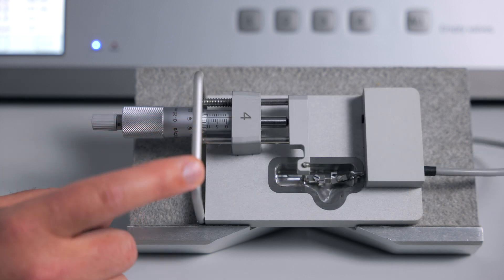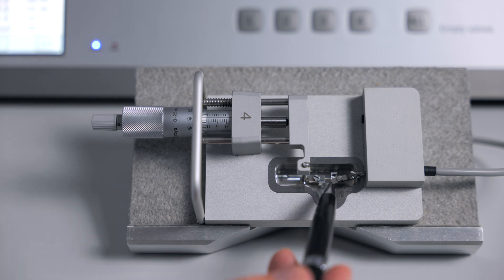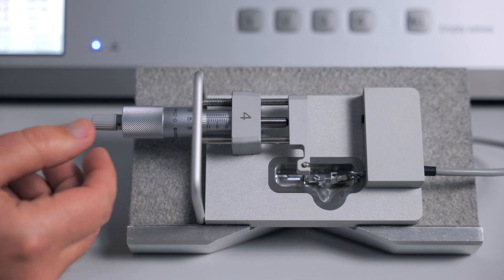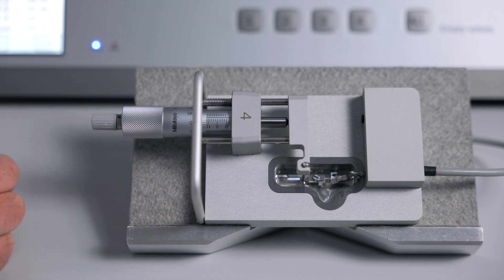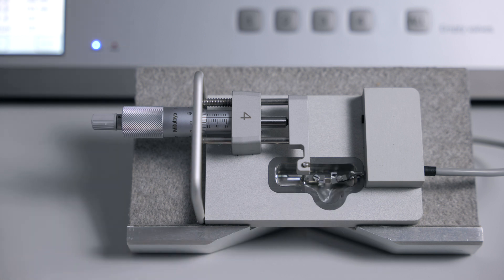The A20MO chambers can easily be removed from the interface and taken to a dissection microscope to facilitate tissue mounting. In the chambers themselves, there are two mounts. One mount is attached to a micropositioner or micrometer, which allows for smooth and accurate tissue adjustment. The second side is connected to a force transducer, which will register the forces generated from your tissues during the experiment. The force transducer is the most sensitive part of the system and must be handled with care.